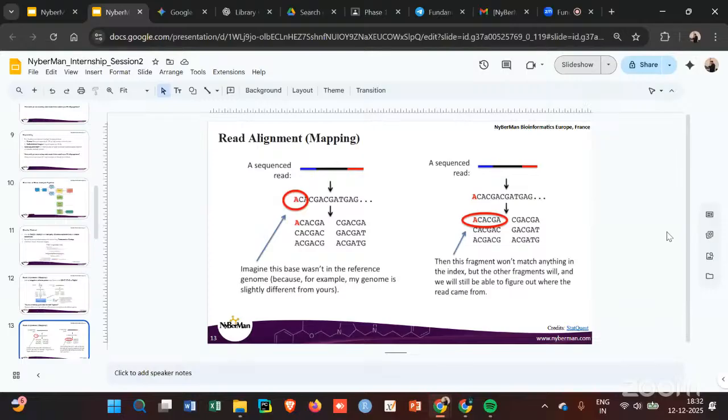So I am going to discard only a nucleotide in this particular sequence, right? No, you won't discard anything. You will take everything from here, because eventually you will not deal with the raw sequences, you will deal with the gene names. That will become clear in the next slide, when we actually assign the gene names to each of these reads. Just bear with me for 2 minutes, you will understand what I'm trying to say.